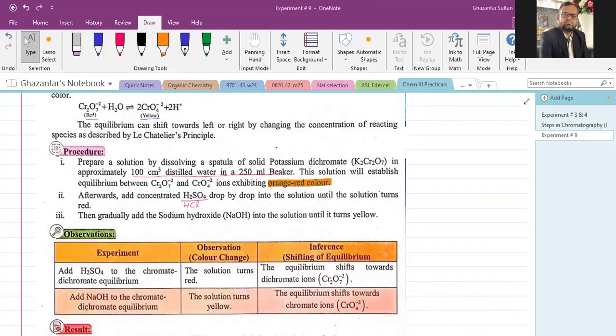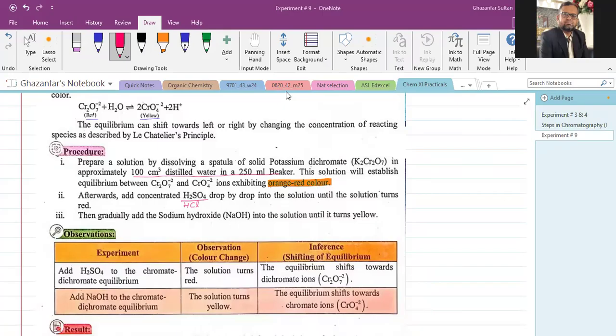Note that adding more water causes the color to shift towards yellow. This is because water appears on the left-hand side of the equilibrium equation — increasing any component on the left shifts the equilibrium to the right, towards the chromate (yellow) side. That is why the solution becomes more yellow as more water is added.